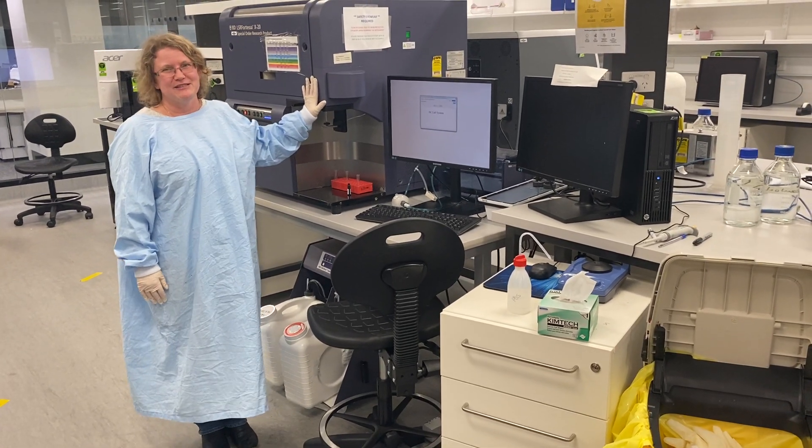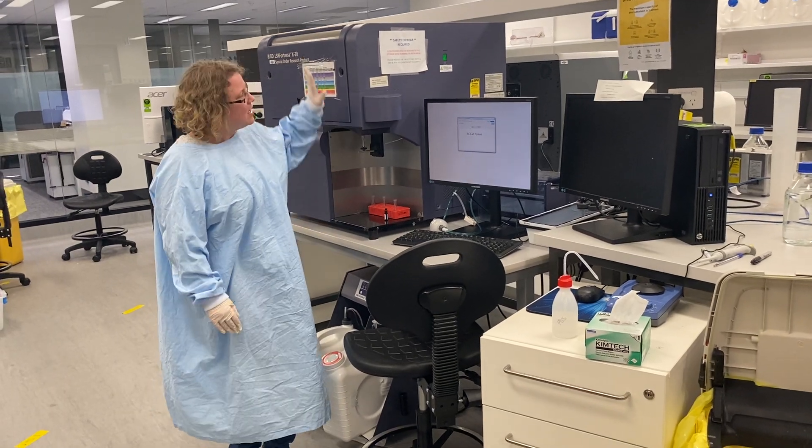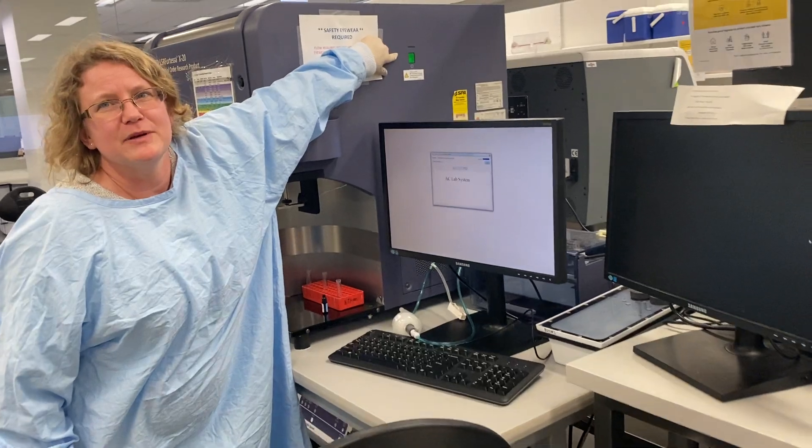This is how to start up the Fortessas — both this one and the Fortessa over there. They're quite similar. For hardware, you press the green button over here to turn the instrument on.